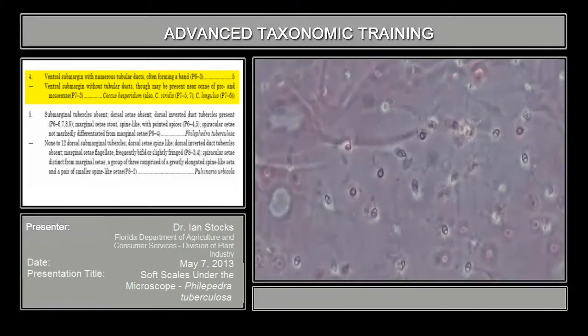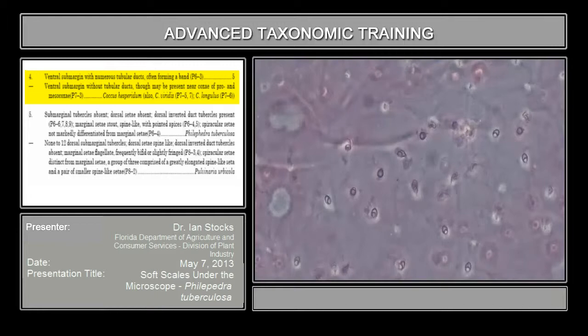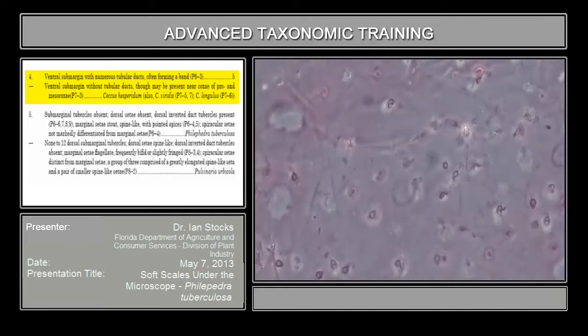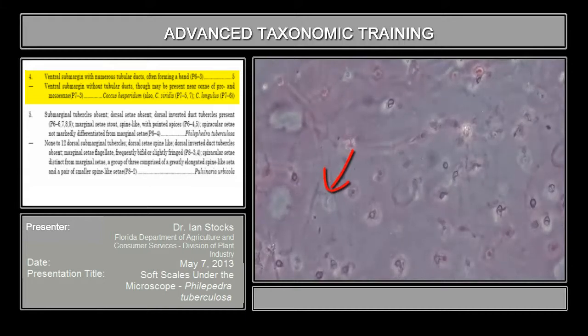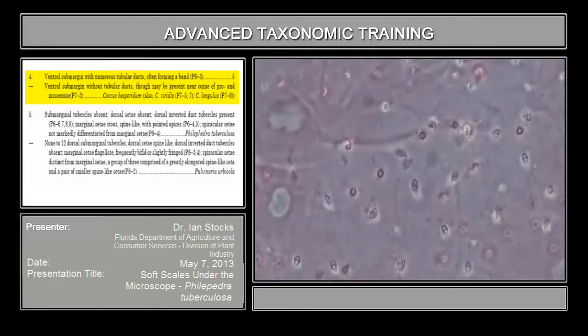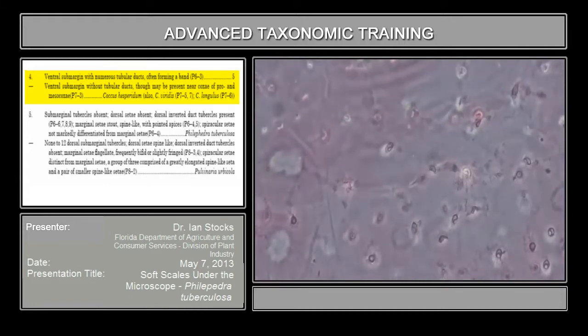Get a bit more detail on the morphology there. So you see they're quite complex. Again, you should be able to perceive, if they've got the right orientation, where the duct opening enters onto the cuticle. You'll see the whitish patch, an inner tube, a sclerotized cup-like structure, and then another much less prominent tubular projection ending in a fairly indistinct gland.